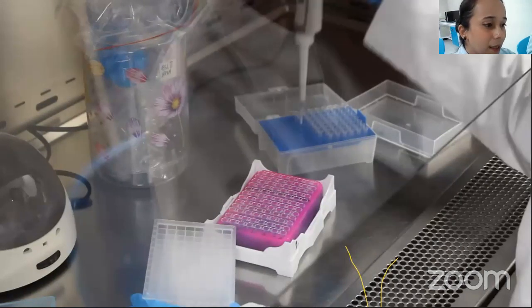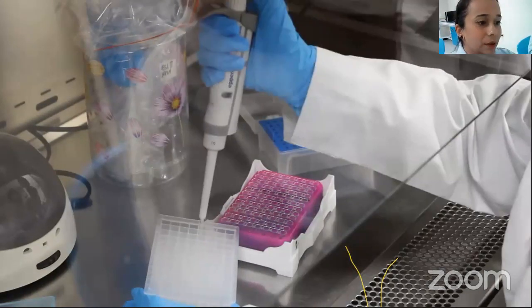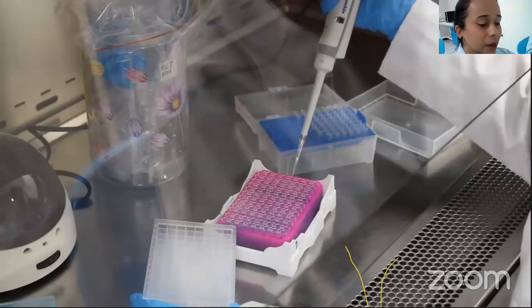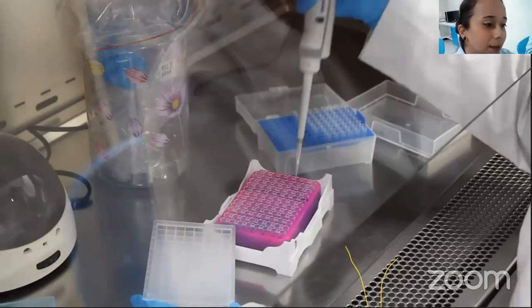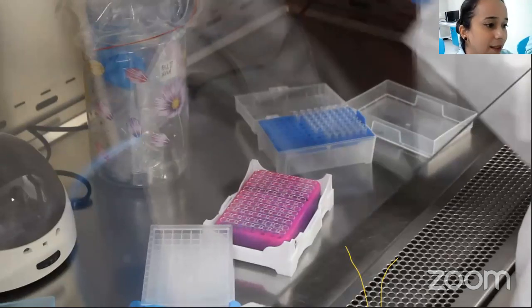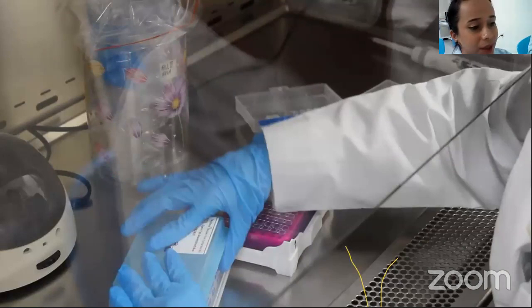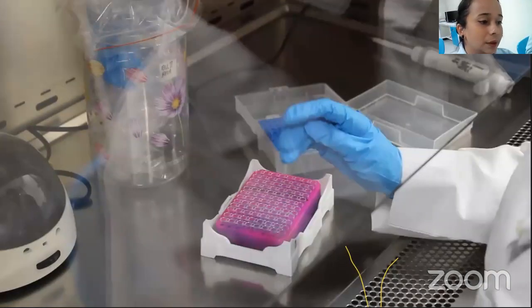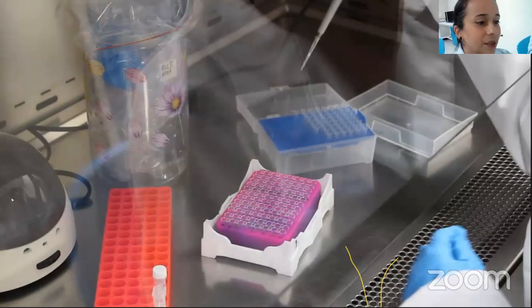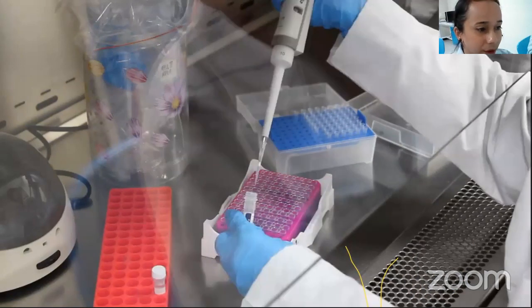Now we are adding the last few samples into the master mix. We leave the last few wells for the controls. The last few wells in the RNA plate, the white plate, are already NEC, that is the negative extraction control, so we have added that to the PCR plate. Now we will be adding the negative control, that is NTC, no template control, and PCT, which is the positive template control. This is the PCT.